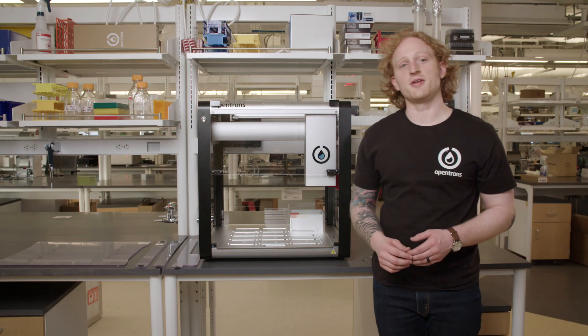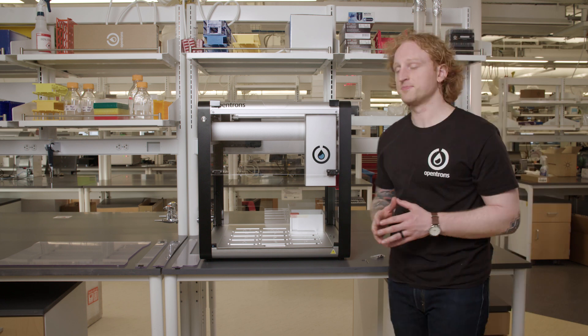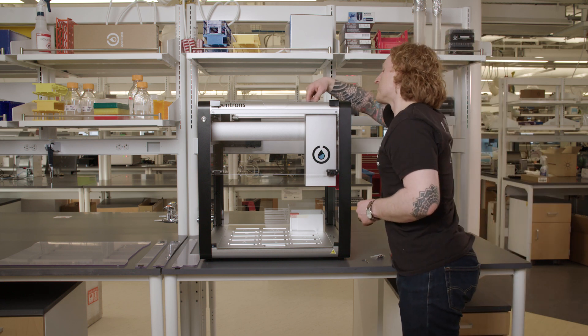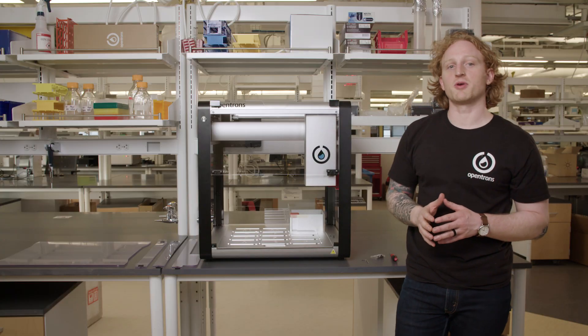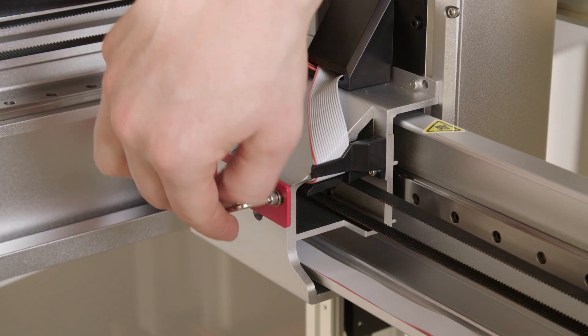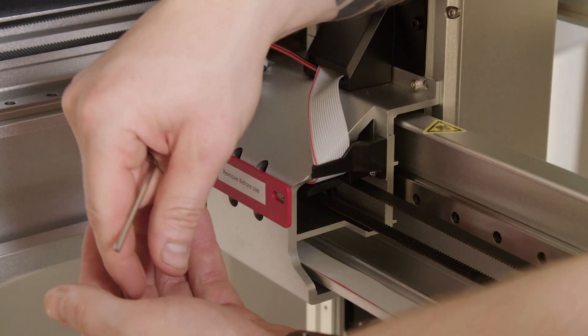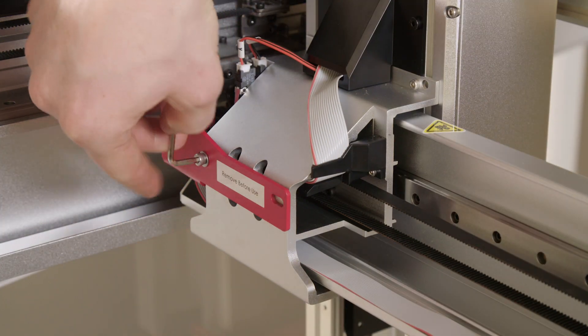The next bracket is held on by three screws located slightly above the pipette carriage. In order to remove this bracket and access the third screw, I will remove the two screws attached to the pipette carriage first.